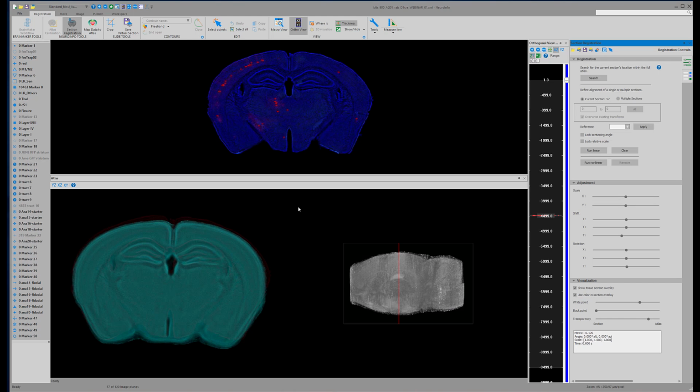You say, okay, I'm here in the brain for the hippocampus, but the section that I'm looking at in the atlas for the paraventricular nucleus or the basolateral nucleus of the amygdala might be in a different section, because the brains are not always cut exactly perpendicular to the Allen space. So you could end up between pages of the atlas.